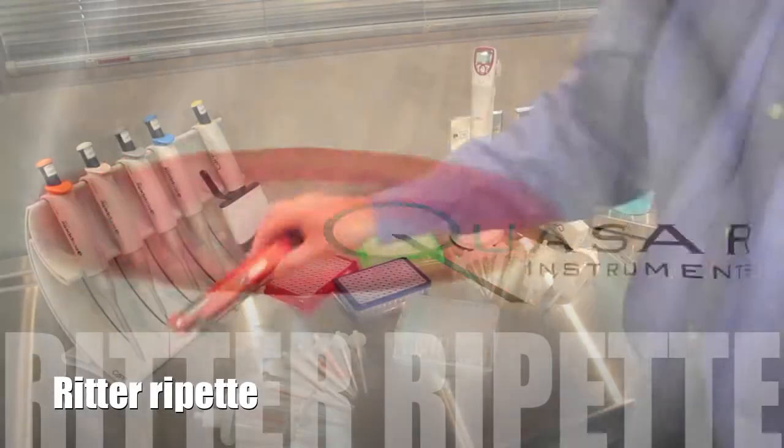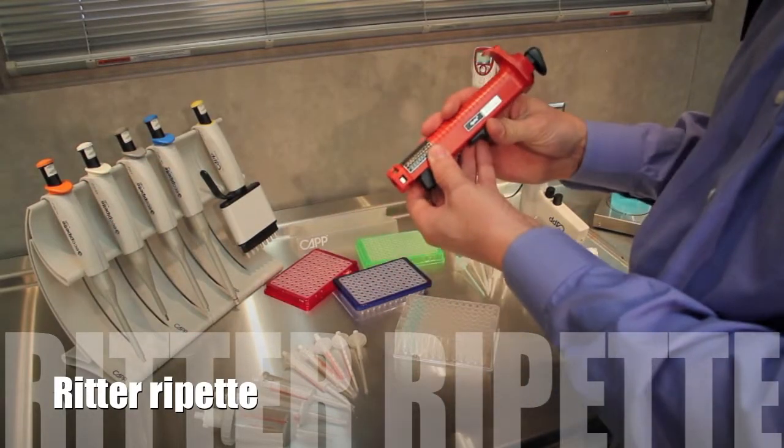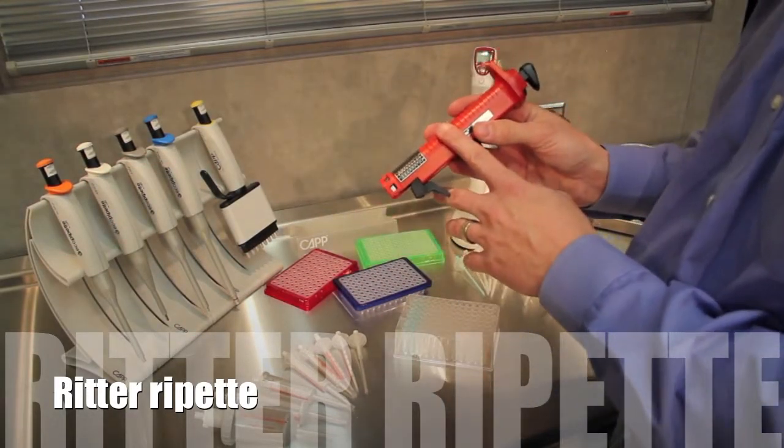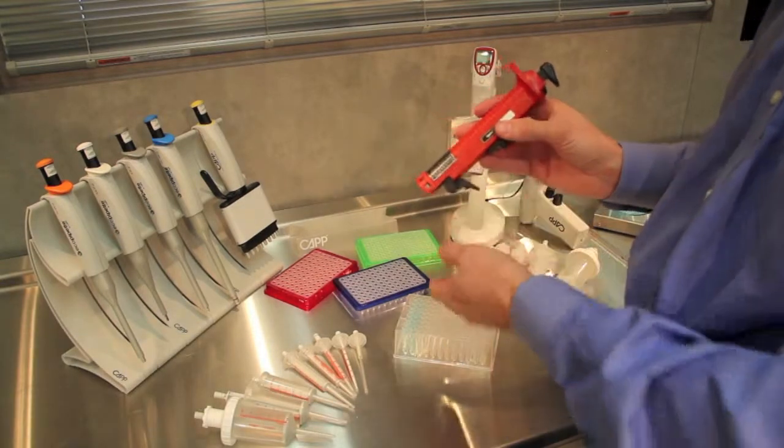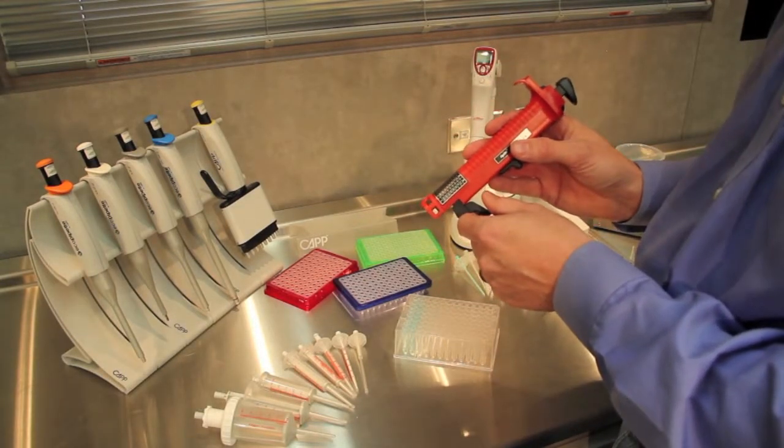The next option we're going to look at is the Ritter Mechanical Repeater. Now this is a great device if you want to essentially do what we're doing, which is fill up many wells with the same liquid and you need the accuracy of a pipette.